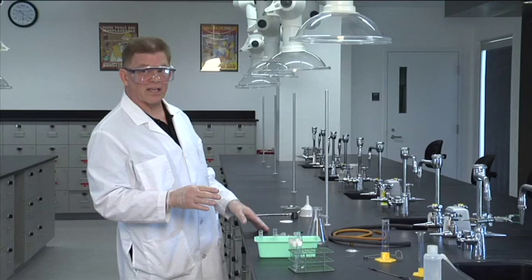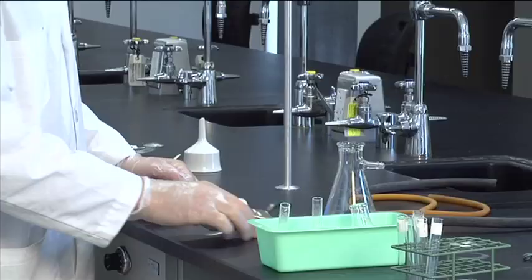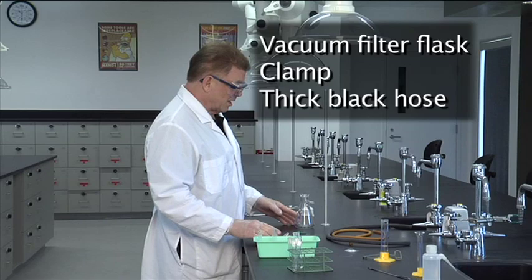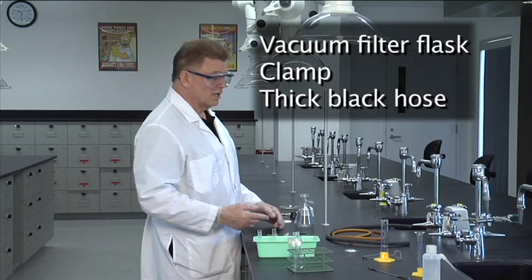To do the vacuum filtration, you need the vacuum filter flask. You're going to need to clamp the vacuum filter flask because, as you will see in a minute, maybe I won't clamp it yet. I'll just show you what's going to happen if we don't clamp it. The answer is it's going to fall over and something's going to break and spill and it will be a mess.